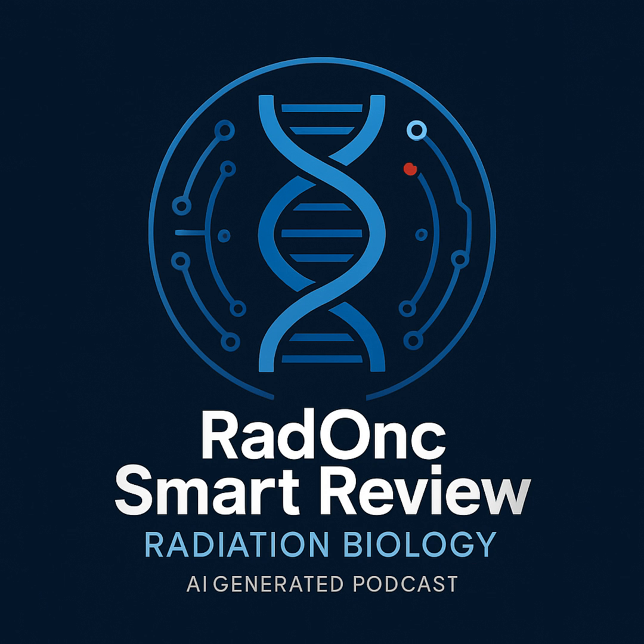Another key technique for studying gene regulation, specifically the activity of promoters or enhancers, is the reporter gene assay. Right. You used the dimmer switch analogy earlier. The promoter is the switch. The reporter gene is the light bulb. That's a great way to put it. The idea is you link a piece of DNA that you think regulates gene expression, like a promoter, to a gene whose product is really easy to detect and measure.